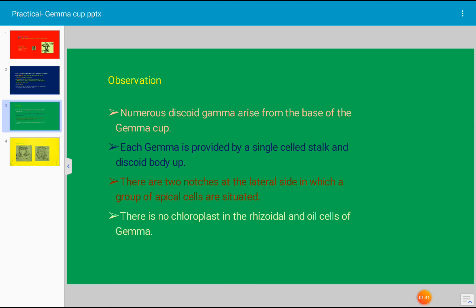There are two notches at the lateral side in which a group of apical cells are situated. There are no chloroplasts in the rhizoidal and oil cells of the gemma.